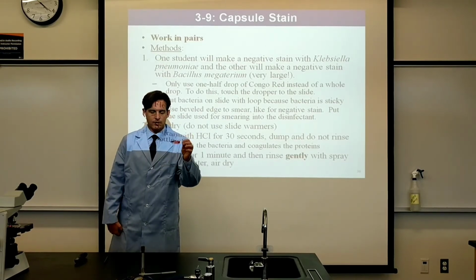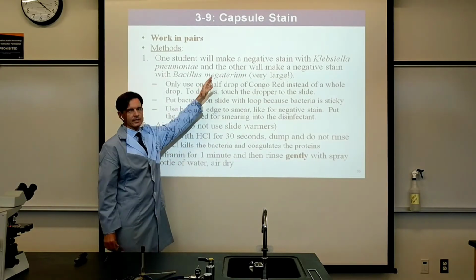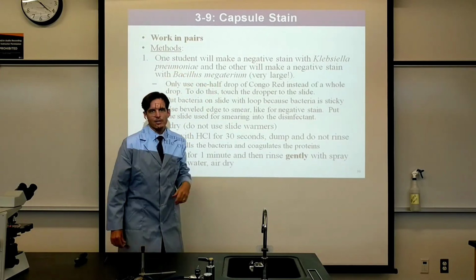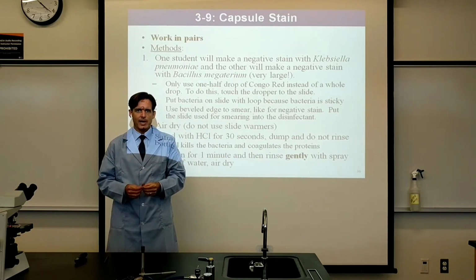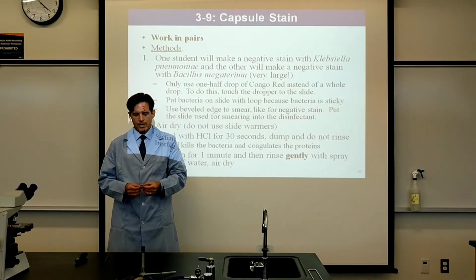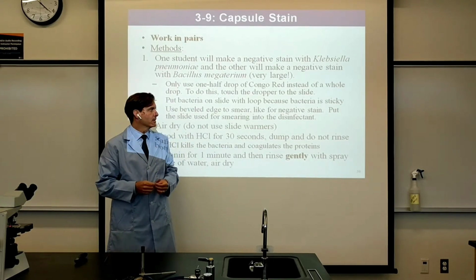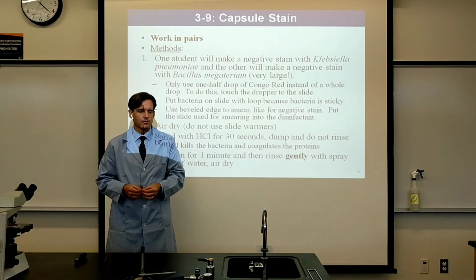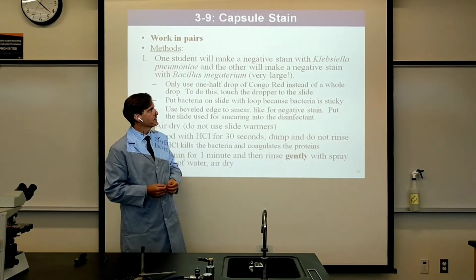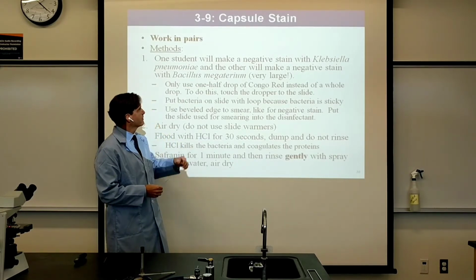This was from my oral cavity from last activity. You could actually do this activity with Klebsiella pneumoniae. Shockingly, we actually are able to safely handle that in here, as bad as it sounds. Aerosols are highly unlikely coming from a test tube and onto a slide, rather than coming out of the lungs of a person who's infected. So we have Klebsiella pneumoniae that I can show you under the microscope. I have some pre-prepared slides.